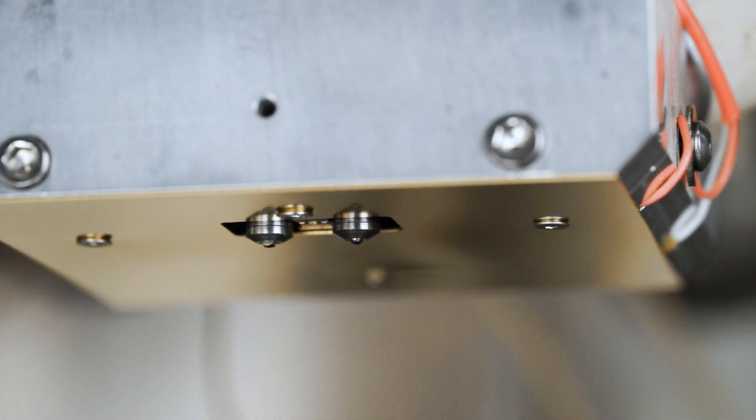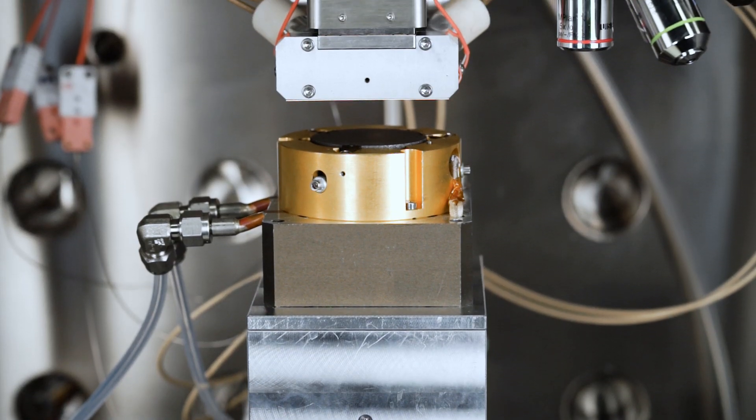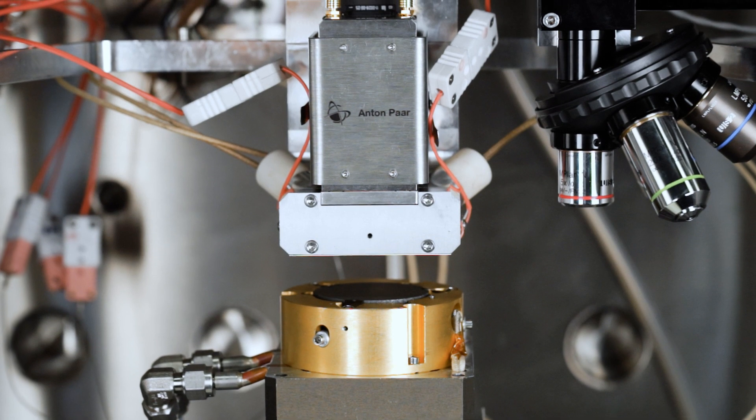The ultra nano indentation head consists of a reference tip touching the surface and an indenter tip for nano indent penetration. It features the lowest thermal drift at ambient conditions and over the entire temperature range.